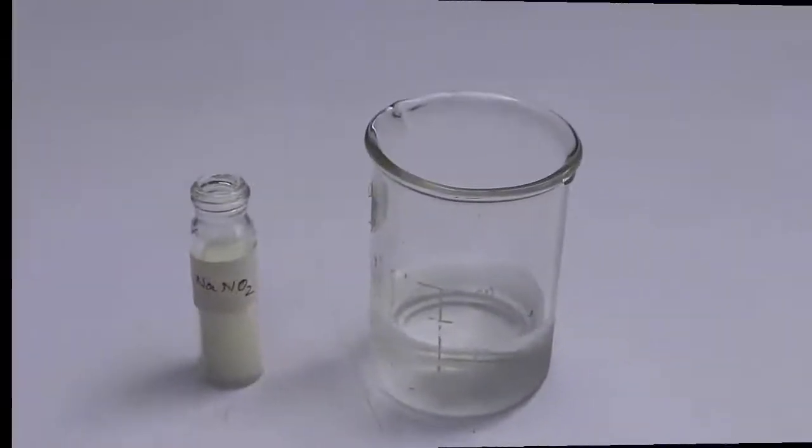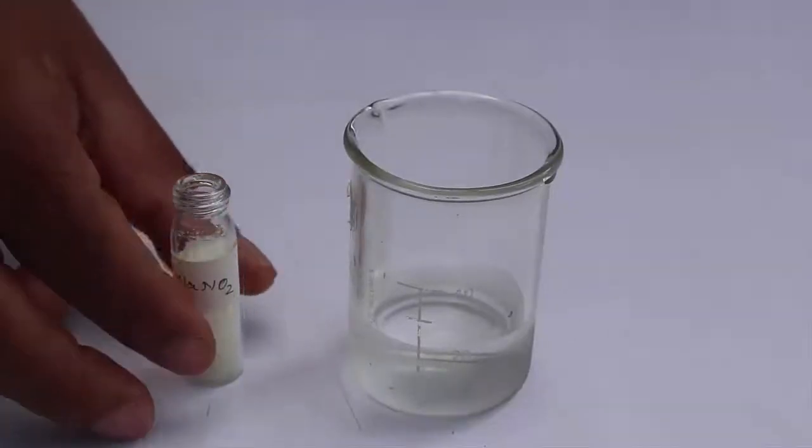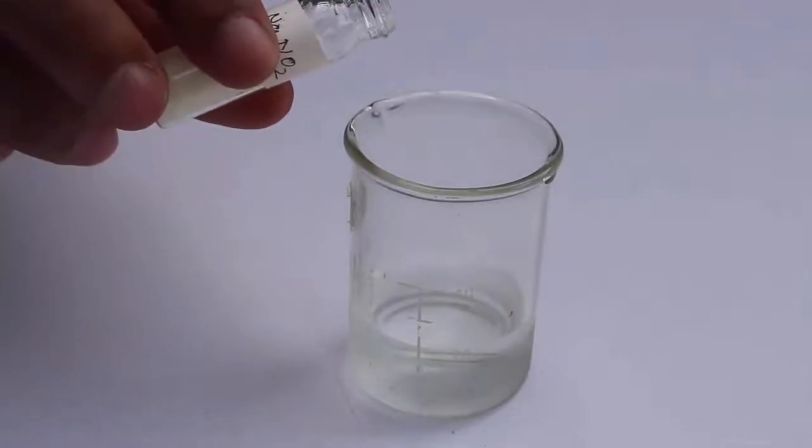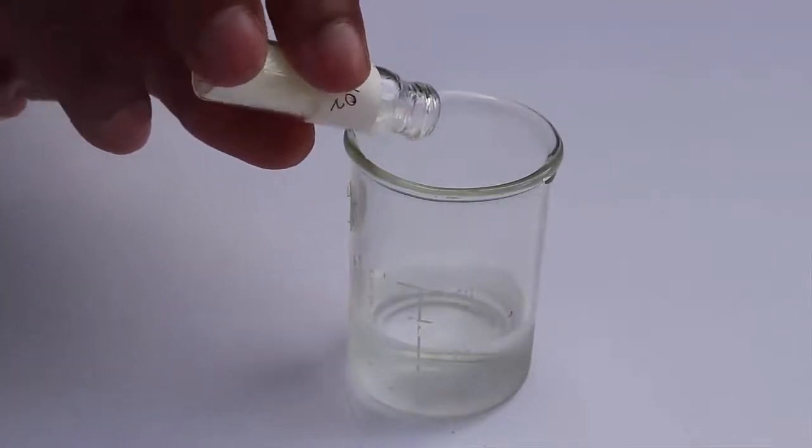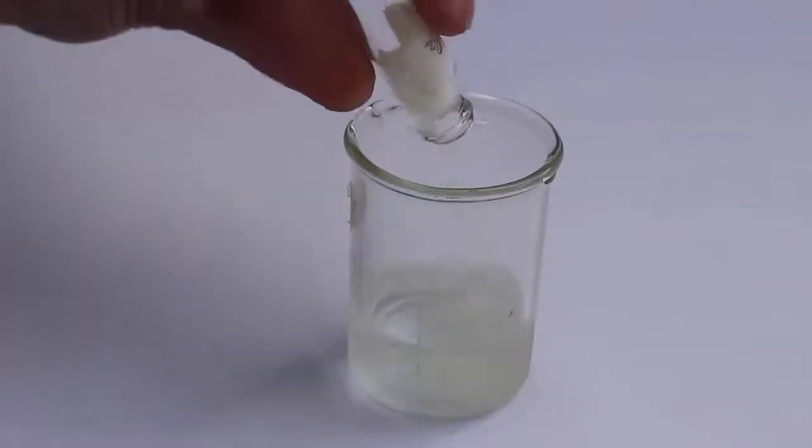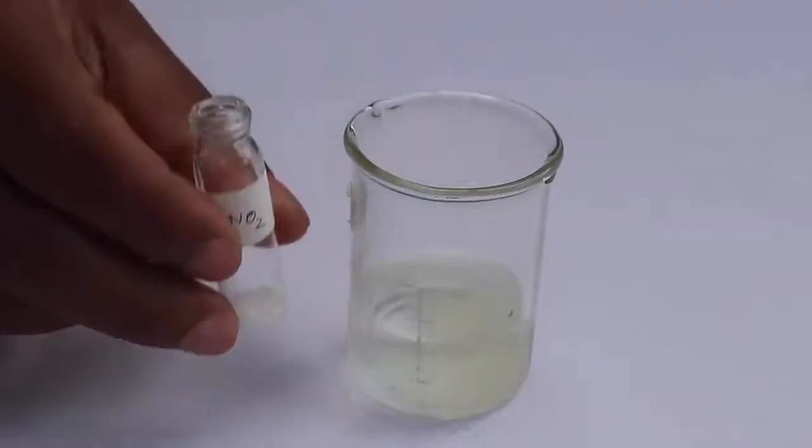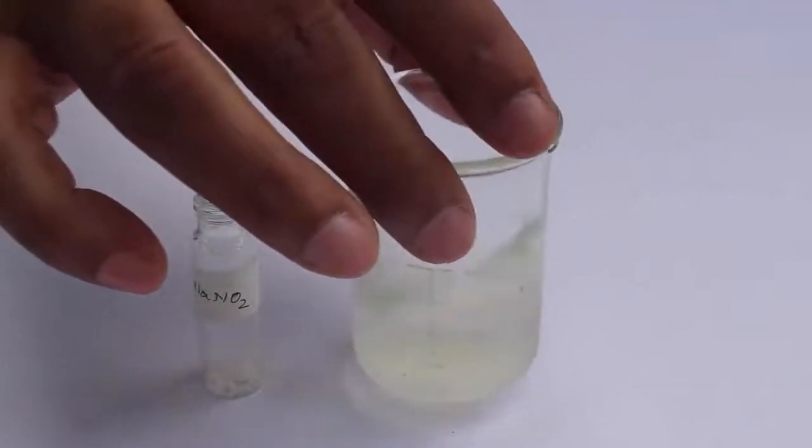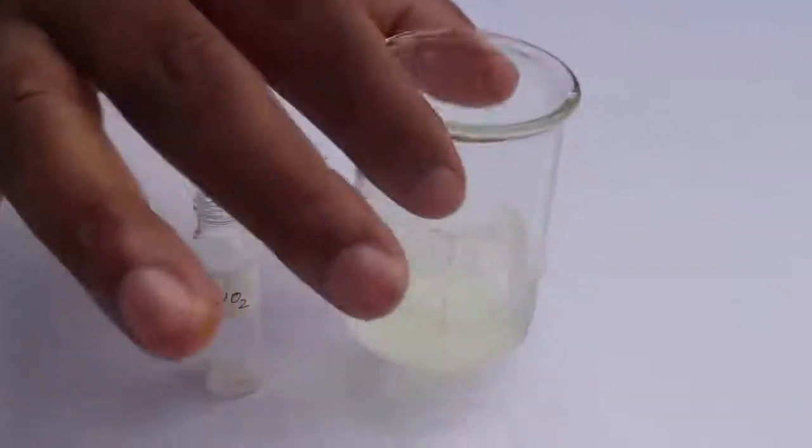Now for the second solution, add a few crystals of sodium nitrite to 20 ml of water in a beaker. Now stir the solution well. This is also an exothermic reaction and the solution will become hot.